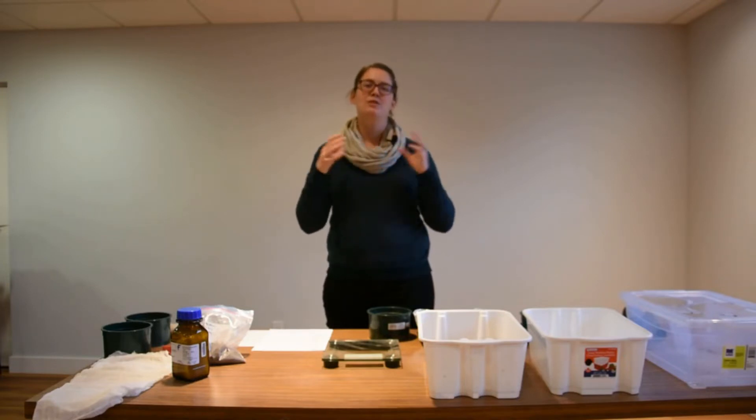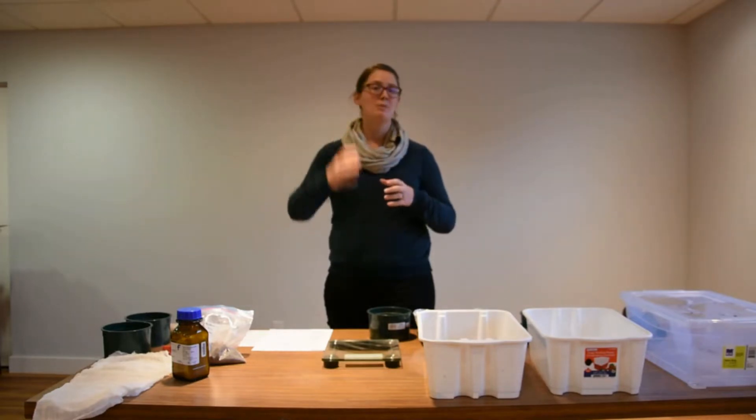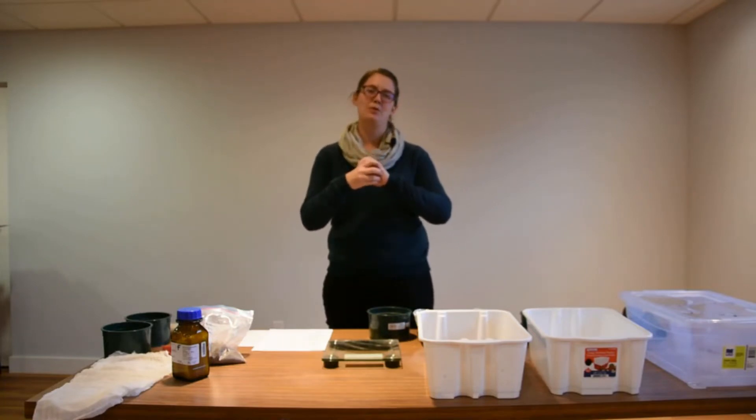We're going to see that through the destructive force of water. We're going to take the soil aggregates, move them up and down through the strong forces of water, and find out how many of them are able to hold together throughout that process.